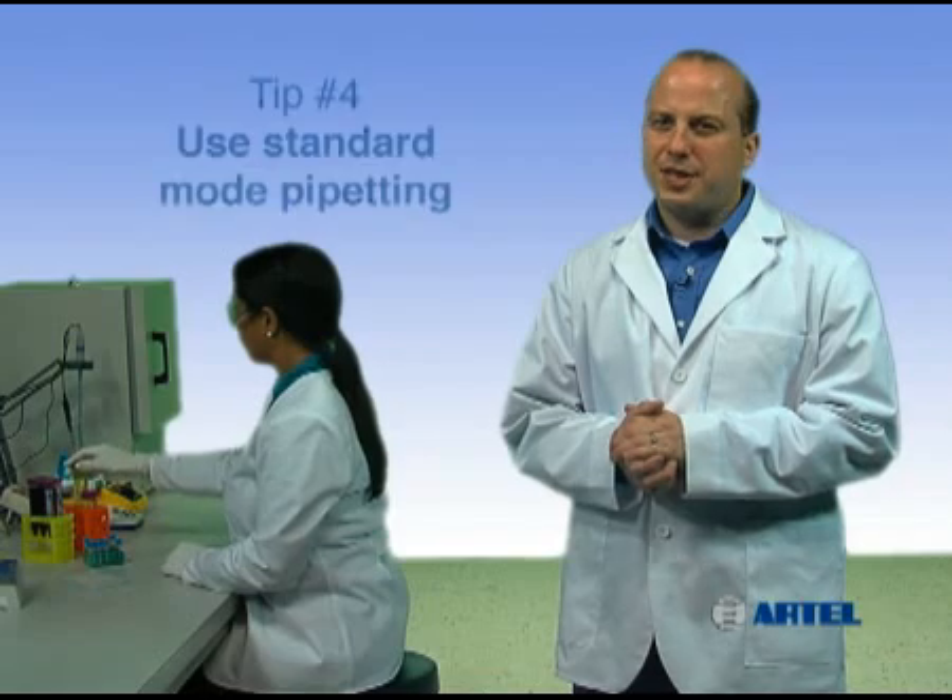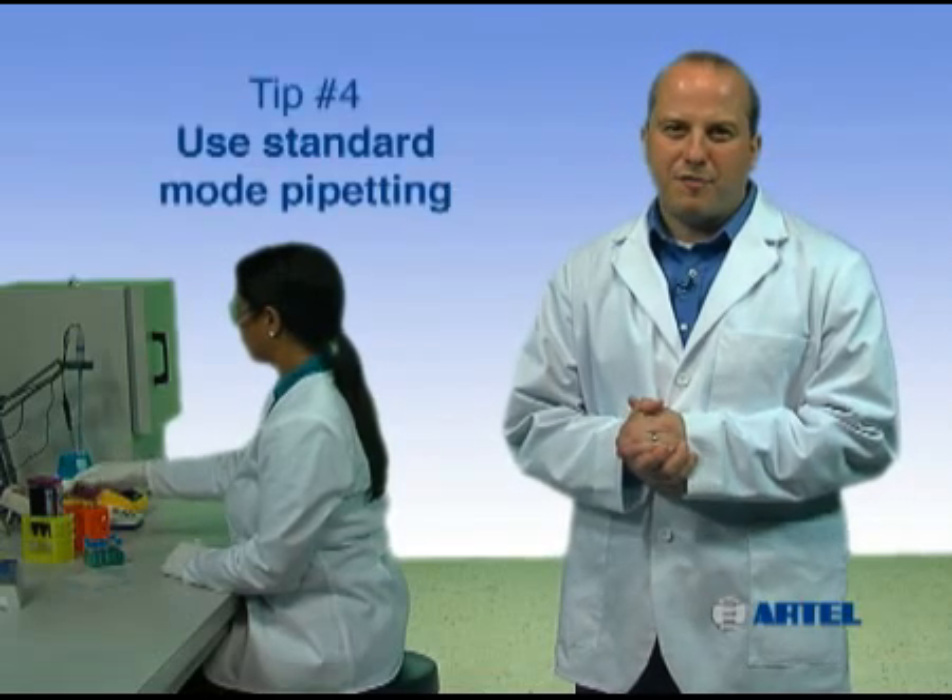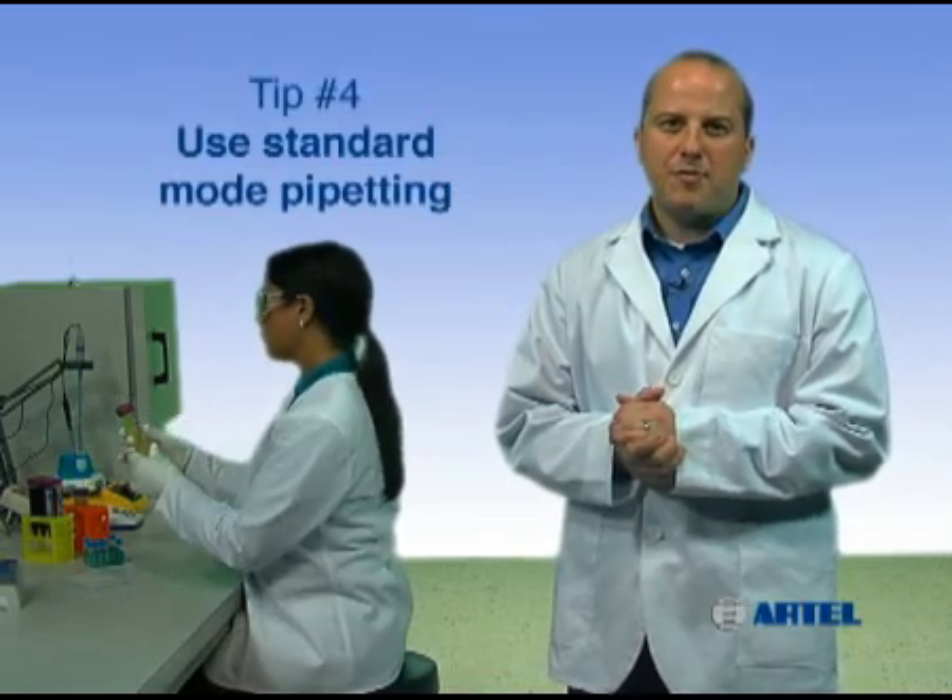Pipetting tip number four: use standard mode pipetting. For most sample transfers, use standard mode pipetting technique.